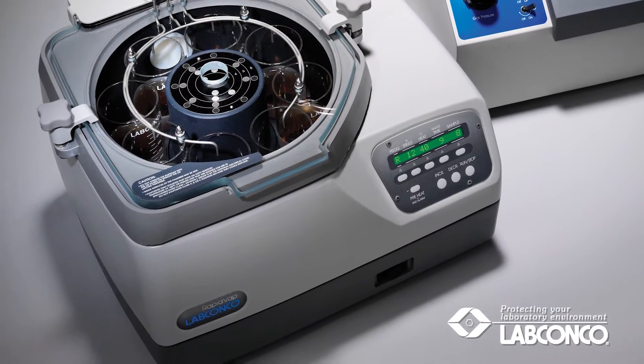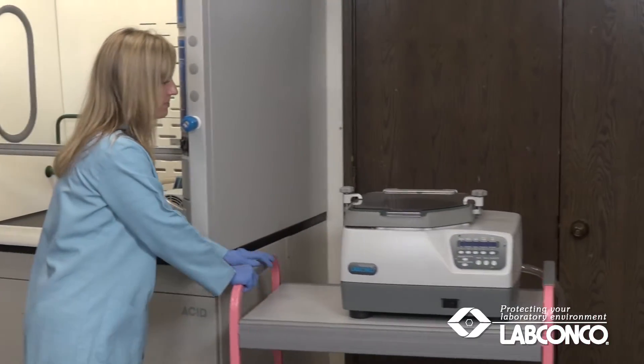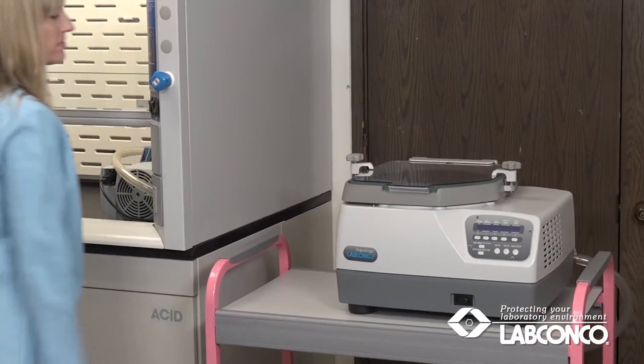Before installing your RapidVap vacuum concentrator, prepare a space for it. It should be located near a fume hood if solvents are used.